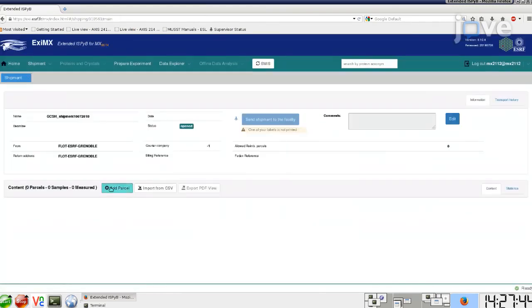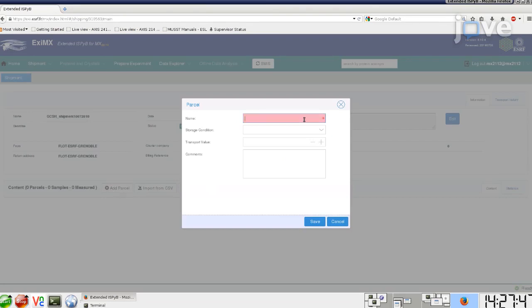Click Add Parcel and fill in the information requested. Click Save.